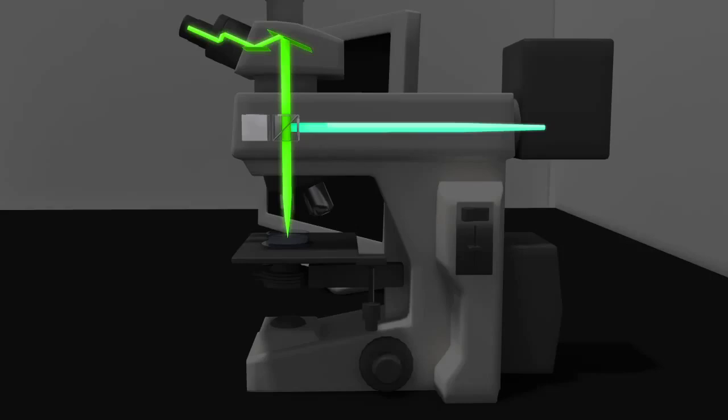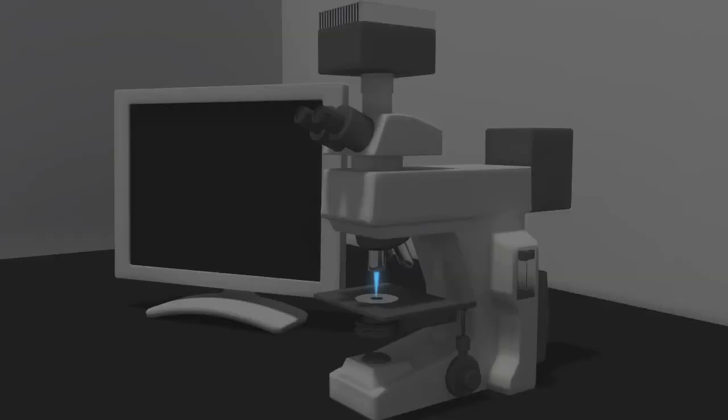One advantage to fluorescence microscopy is that it can be used to detect and visualize multiple fluorescent molecules by simply adjusting the excitation and emission filters to detect the relevant fluorophores in a sample. Fluorescent microscopy also has many useful applications in the laboratory setting. Fluorescent dyes or stains are used to detect cellular structures.